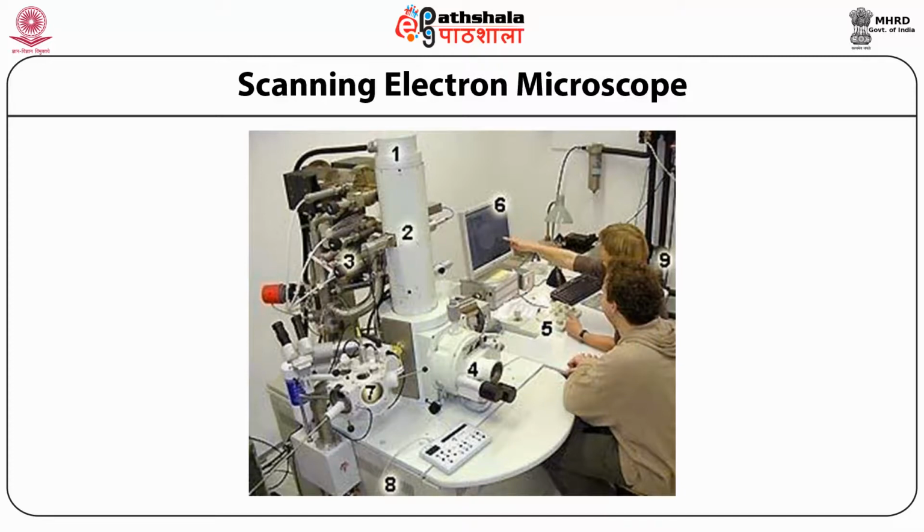Pump system for vacuum. 4 is the opening to insert the sample into the high vacuum observation chamber in conventional SEM mode. 5. Operational panel with focus, alignment, and magnification tools, and a joystick for positioning of the sample. 6 is the screen for menu and image display.